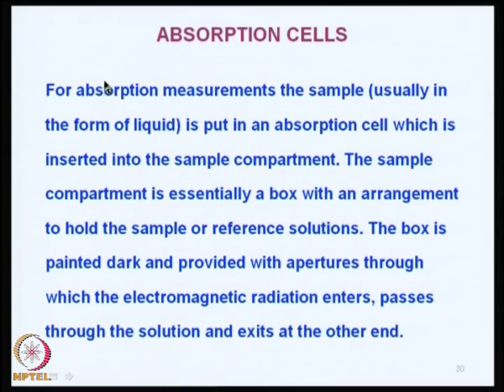Now, we move on to the other aspect of spectrophotometric instrumentation, that is absorption cells. In absorption measurements, we take the sample in the form of a liquid and it is put in an absorption cell which is inserted into the sample compartment. What is an absorption cell?